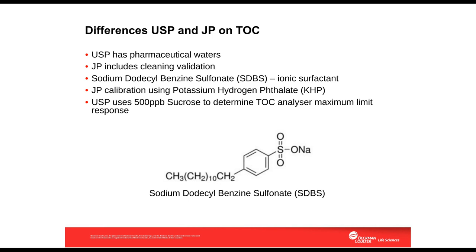So as the organic compounds found in cleaning rinse waters may be more complex and difficult to oxidize molecules than those expected in pharmaceutical waters, the Japanese Pharmacopoeia chapter on TOC calls for the TOC analyzer to be challenged with a solution of the ionic surfactant SDBS. So it's typical, an ionic surfactant can be used in the cleaning process, so they expect you to be able to analyze SDBS.